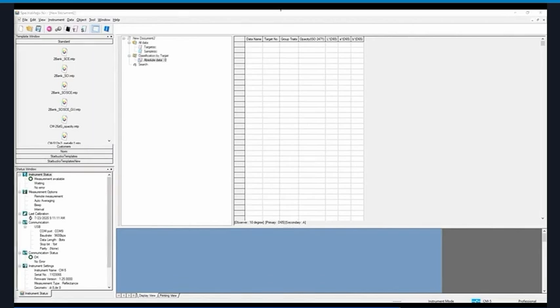Now that we are ready to measure opacity, we need to select our backing material and define it in our standard operating procedure. We will not be using the internal white calibration plate as the backing material, as the backing needs to be in contact with the sample and also behind it. We also would not want to use an external white calibration plate as the backing, because repetitive placement and removal usually leads to scratches, fingerprints, wear, or other unintentional damage to the calibration plate. Such damage impacts the accuracy and precision performance of the instrument.